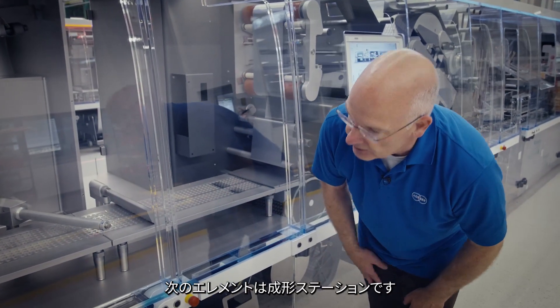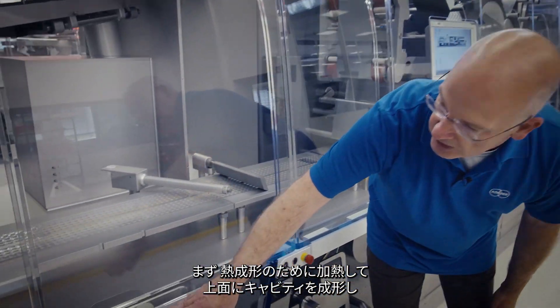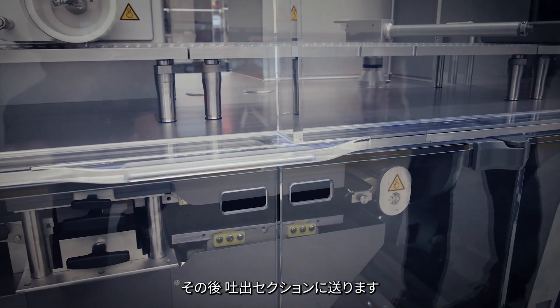The next element is the forming station. It starts with heating for a thermoforming format and then upward forming the cavities, which are then presented into the dosing section.